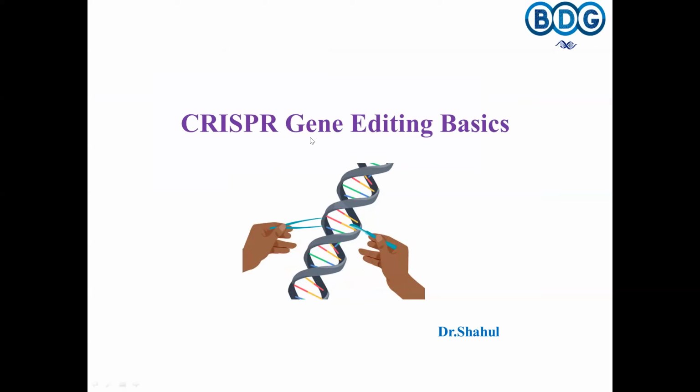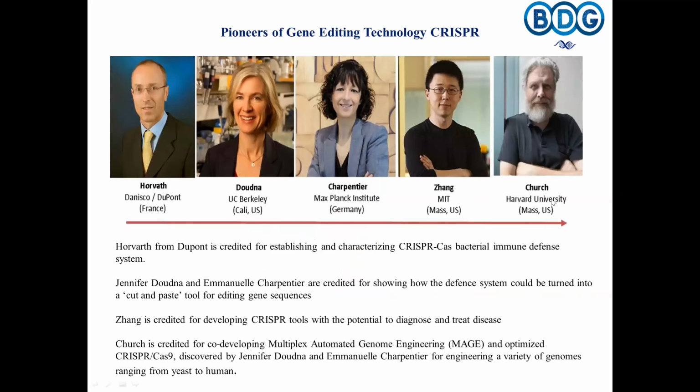Okay, so let us start. Ten minutes gone already. Today we will see the basics of CRISPR. CRISPR is actually a gene editing tool. So we will see the basics of CRISPR, and I'll also demonstrate certain software tools. Now, the pioneers of gene editing technology, CRISPR, are shown in this slide.